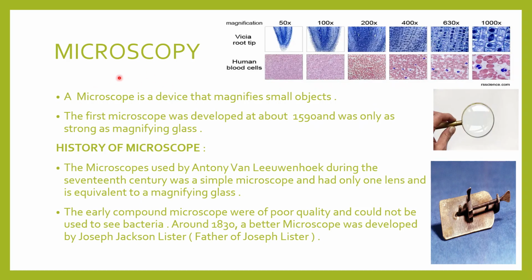Okay, let's get started. In this video tutorial, we'll mainly study the microscope, its parts, and the different types of microscopes, and we'll study in detail the compound microscope and its parts. A microscope is a device that magnifies small objects.